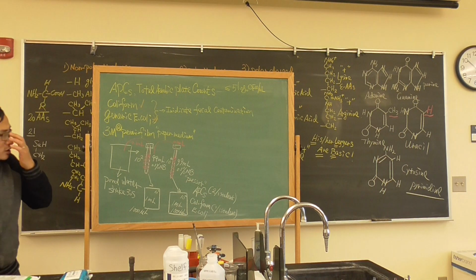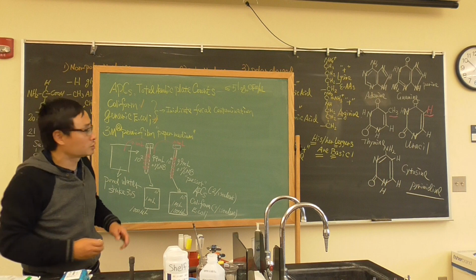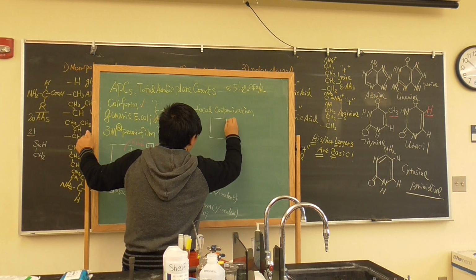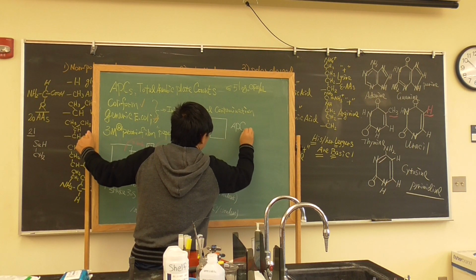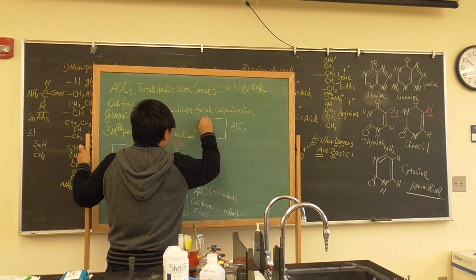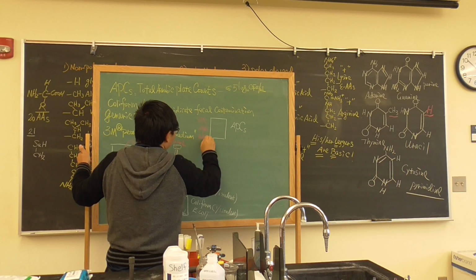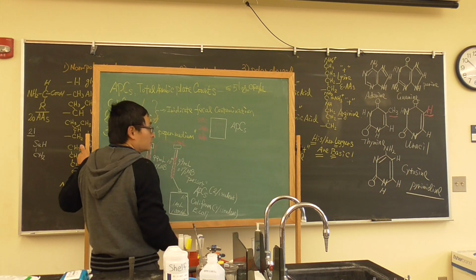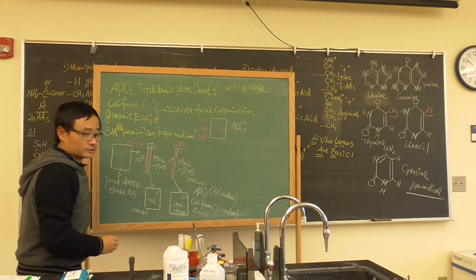Now the next question is, how do we know it is APC? How do we know it's coliform? How do we know it's E. coli? It's a little tricky, so we want to talk about that. Okay, in this yellow APC petrofilm, after incubation, 35 degrees Celsius, 24 hours, sometimes we have to do 48 hours, okay? You see these very tiny dots or pink colony. We call it APC, aerobic plate counts.